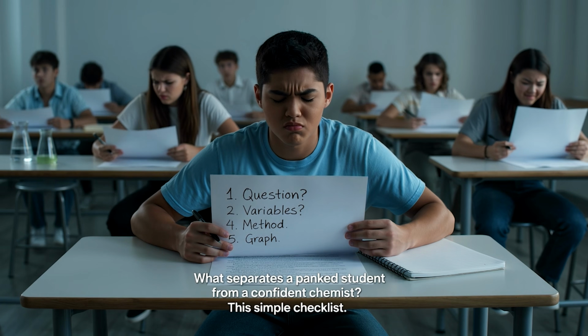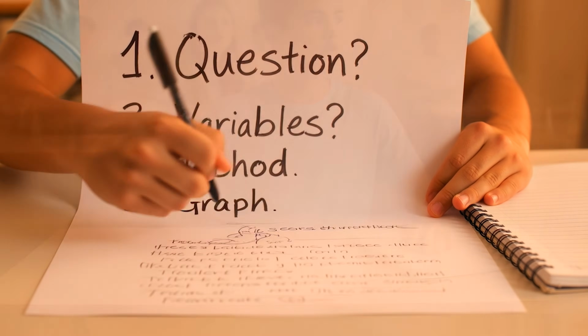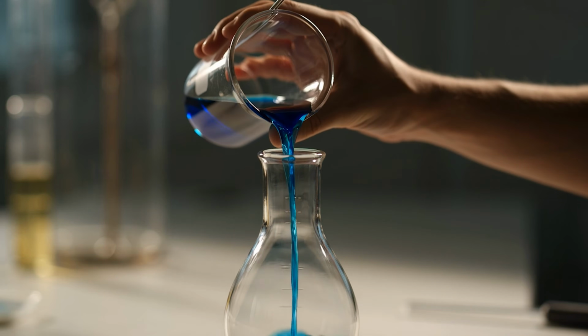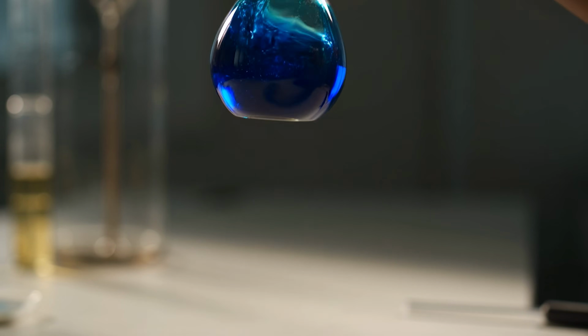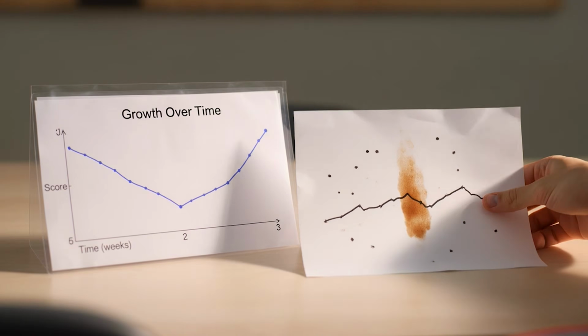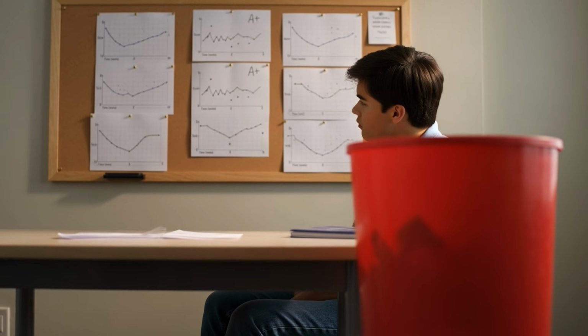Feeling lost? Go back to the question, list your variables, then act. That checklist saves your grade. Volumetric flask, make up to the mark exactly, then invert 20 times. No shortcuts. Precision is everything. One graph gets marks, the other gets the bin. The choice is yours. Make it a good one.